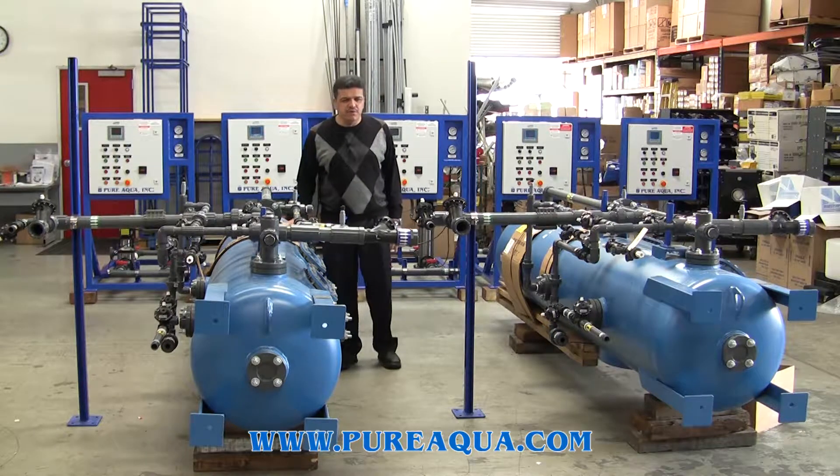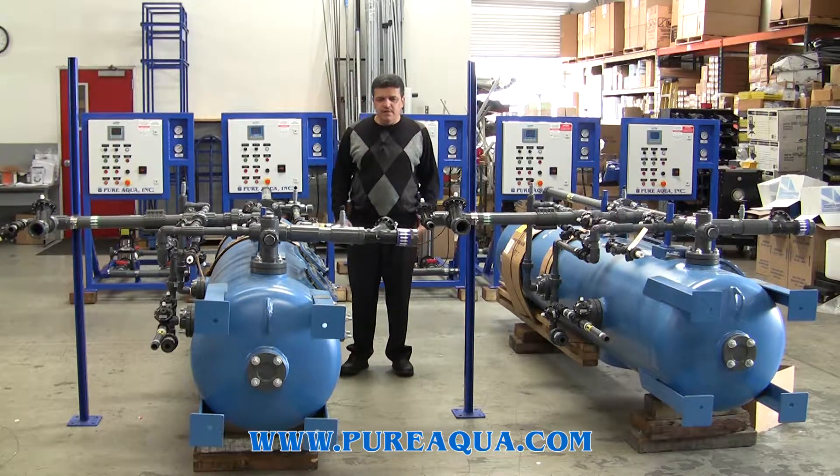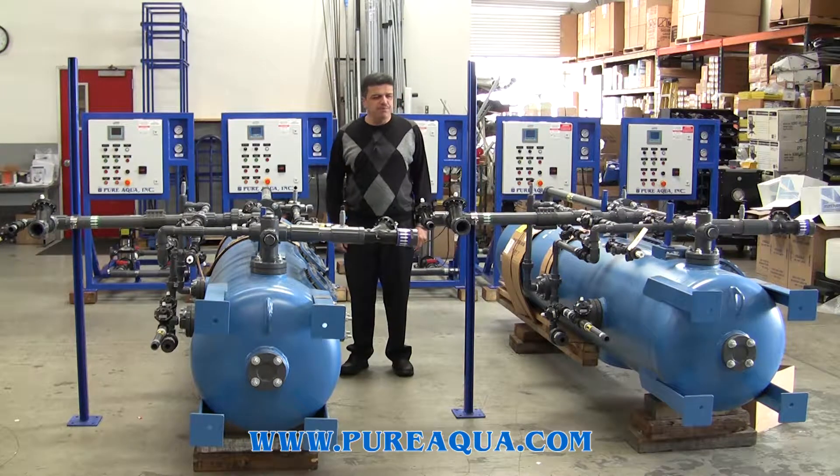The purpose of this system — the water is going to be used for laboratory water for doing experiments in the chemical engineering and chemistry departments.